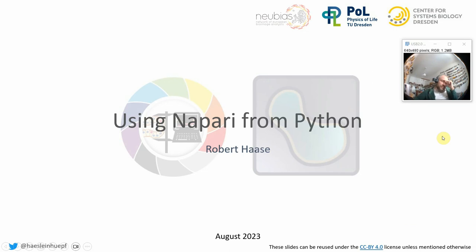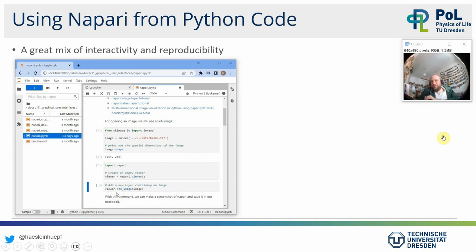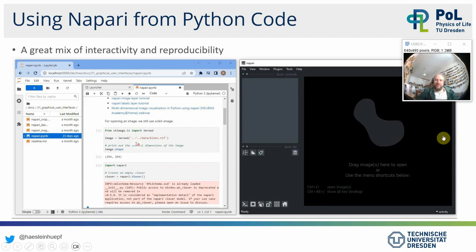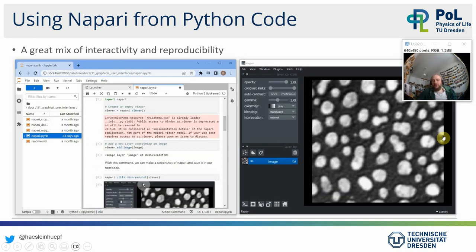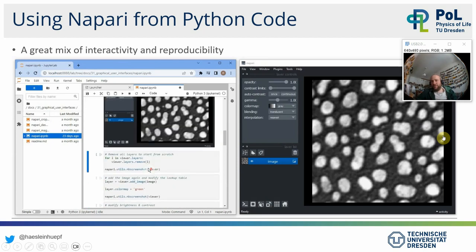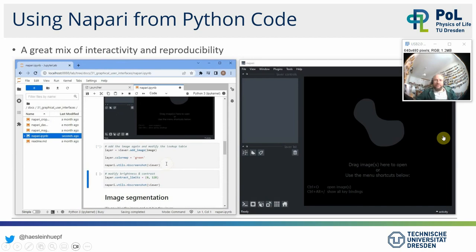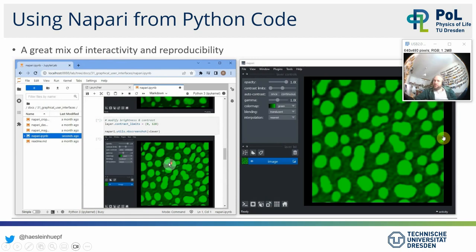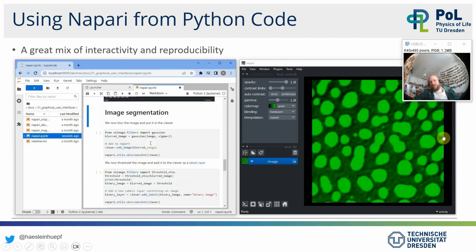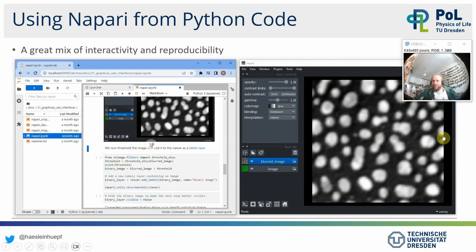Creating new labels layers, annotating something, running a plugin, getting a new labels layer out, and hiding and showing layers — these are very common tasks when working with Napari. It makes sense to get used to these controls. Napari is also recommended to use from Python code or from a Jupyter Notebook. If you use a Jupyter Notebook on the left and Napari on the right, it's a very nice interactive tool where you can load data with Python code and put it in the viewer.